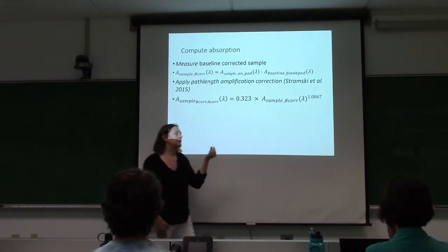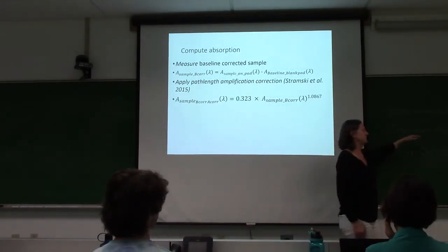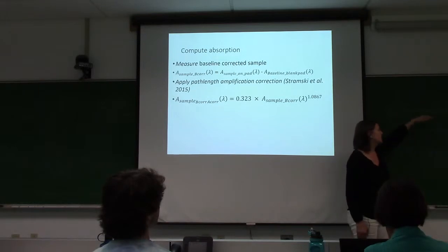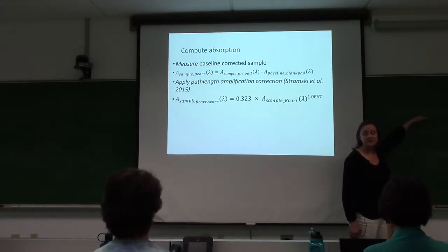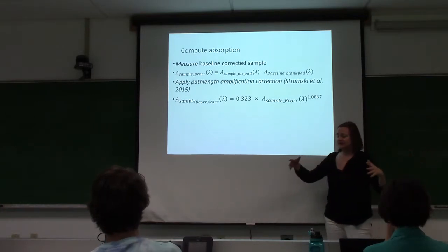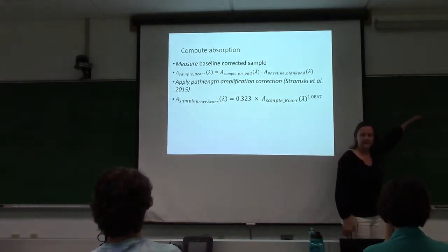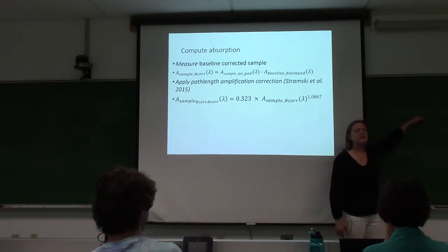But the problem with the transmission mode is that, and I'll show you, it has other sources of error that you have to account for. And so if you have the opportunity to use this, I recommend this. And as you go forth and graduate and set up your own labs, and if this is going to be the work that you're doing, invest in the center-mounted integrating sphere. Your life will be so much simpler and so much more accurate.